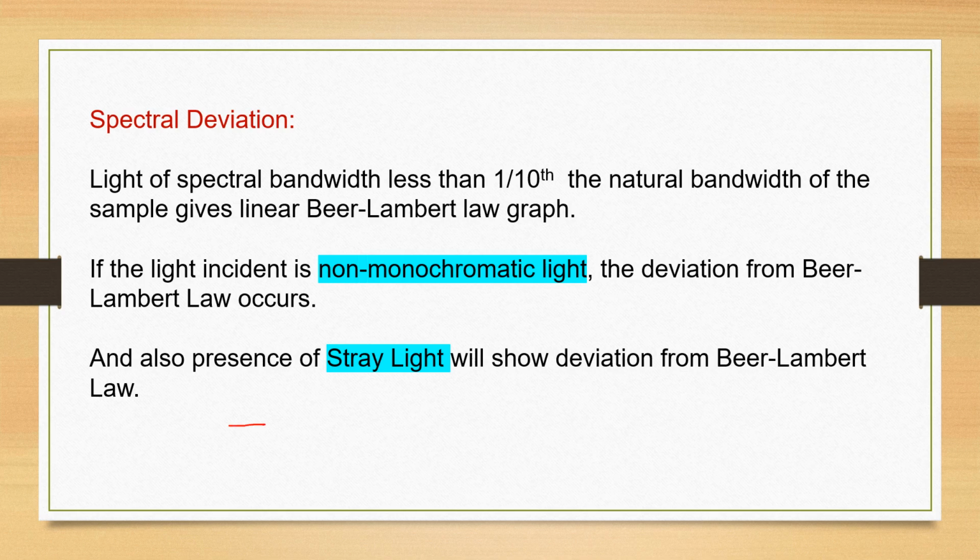For example, a sample absorbs light from 510 nanometers to 720 nanometers.